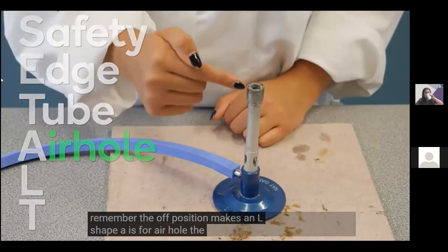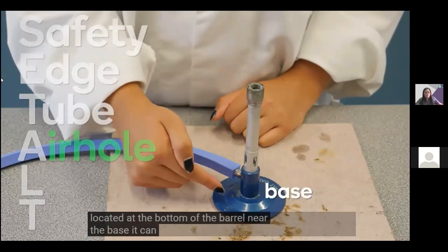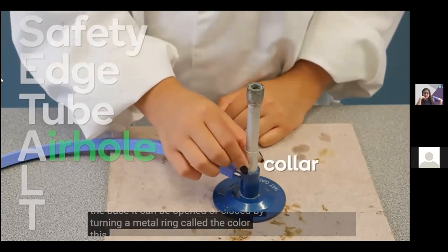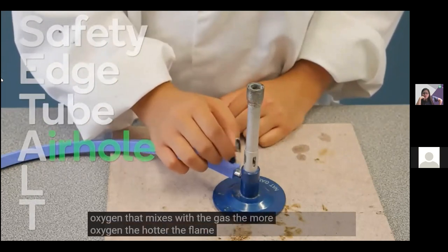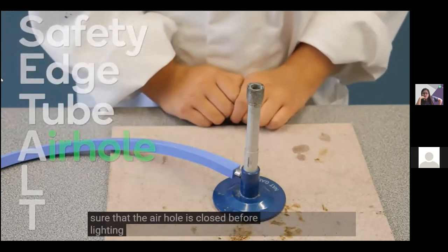A is for air hole. The air hole is located at the bottom of the barrel, near the base. It can be opened or closed by turning a metal ring called the collar, which controls the amount of air and oxygen that mixes with the gas. The more oxygen, the hotter the flame. Always make sure the air hole is closed before lighting the burner.